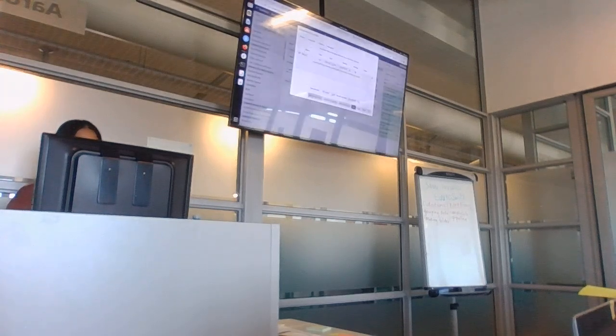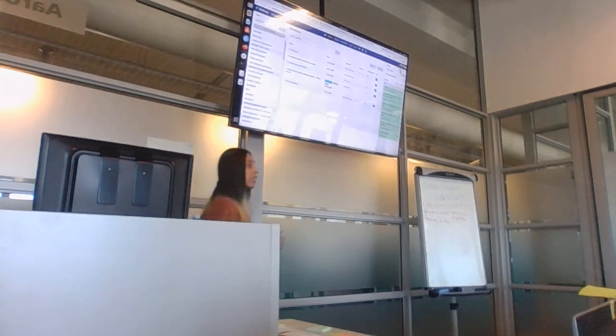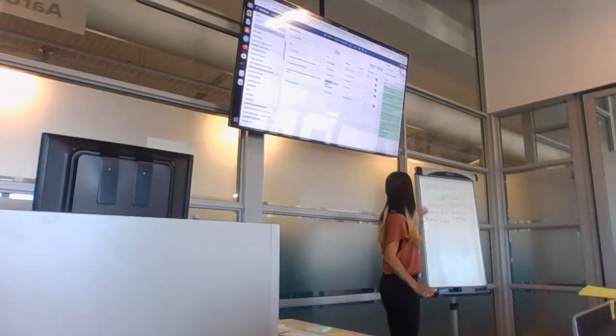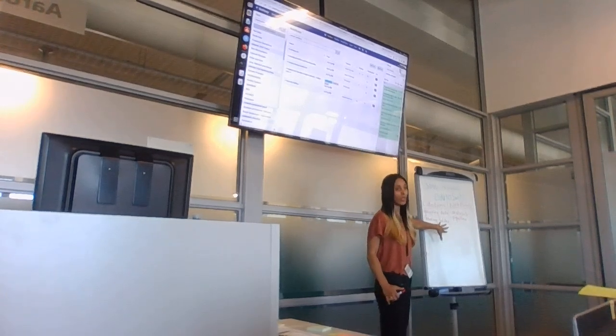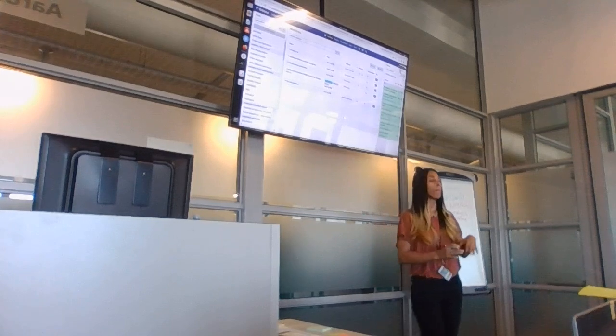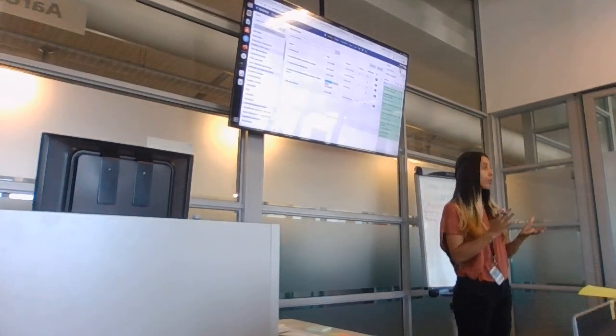But before you did that, you created a new history. And the reason for that is you wanted to make a new folder where you could put this new data in. So you can see you're creating a new history as a means to create a separate folder for new input data.